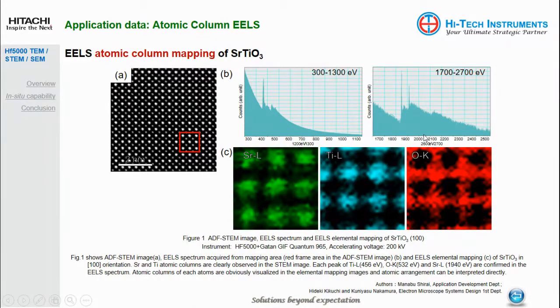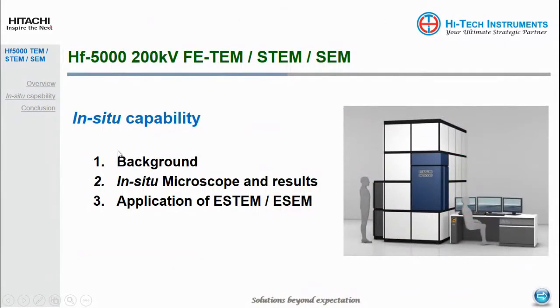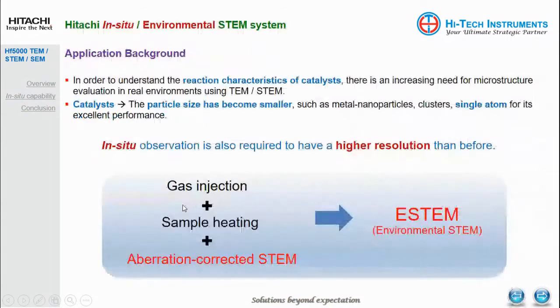Now I would like to introduce the in-situ capability, all those capabilities within the HF5000, and how this in-situ capability can be realized in the HF5000. I will introduce the background, the in-situ microscope and results, and some applications.